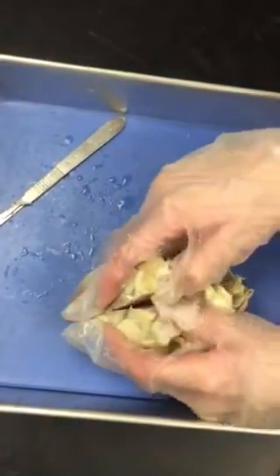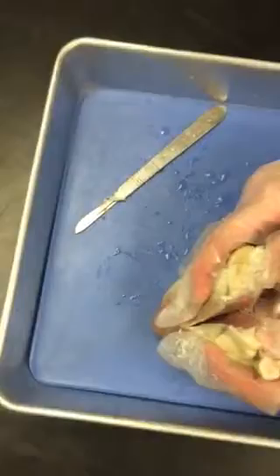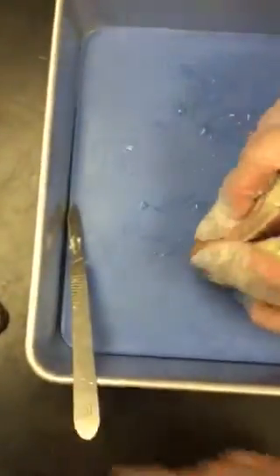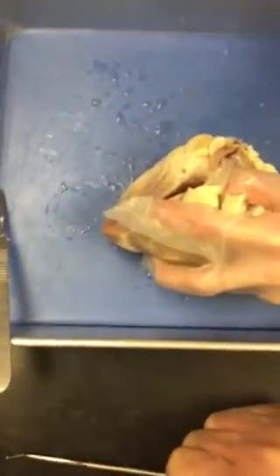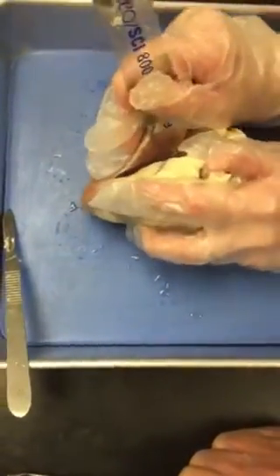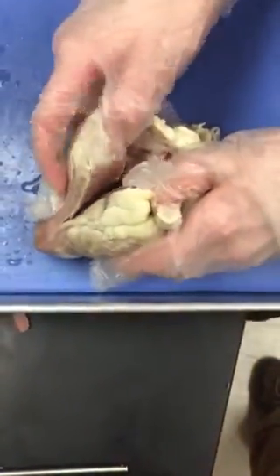Carefully pull the wall back and observe the various tissues. 36. Use a metric ruler to measure the thickness of the wall of the left ventricle in millimeters and record the measurement. 37. Compare the thickness of the wall of the left ventricle to the wall of the right ventricle.